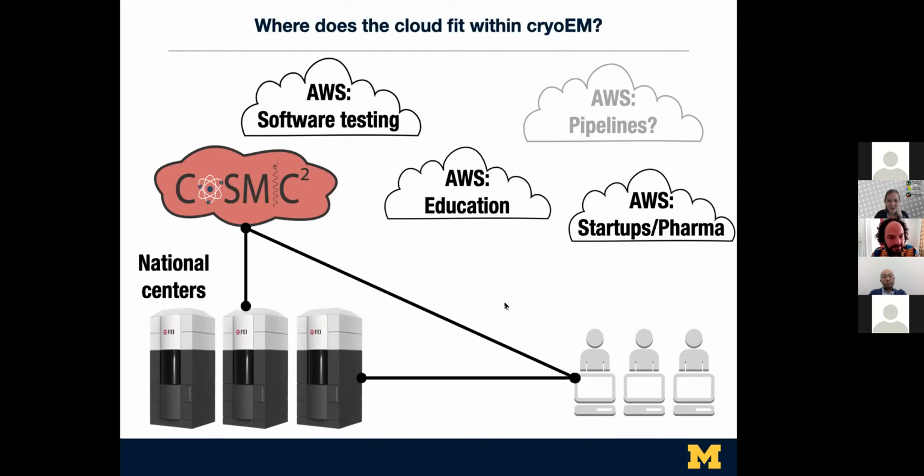Someone asked, is your implementation available? Have you considered contributing the functionality to Scipion? We've looked at Scipion a lot, as they are also pioneering interoperability between software in cryoEM. We haven't yet because we have this web interface, and Scipion has their own interface, so we've been trying to figure that out. Obviously it'd be nice to dovetail off of what they've done. So not yet, but I think the Scipion team is thinking similarly, for sure.